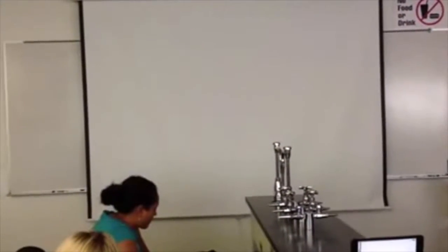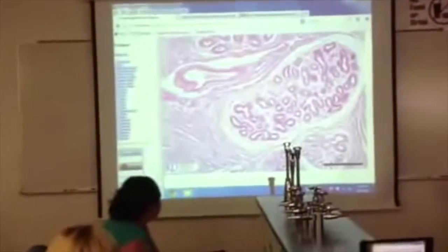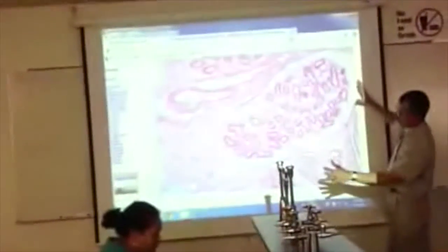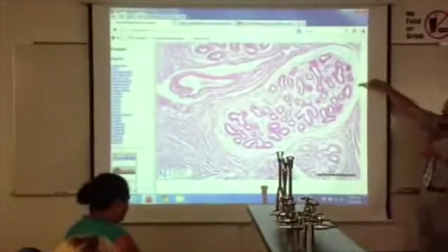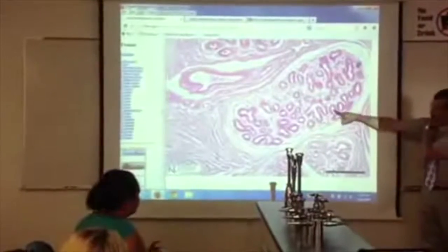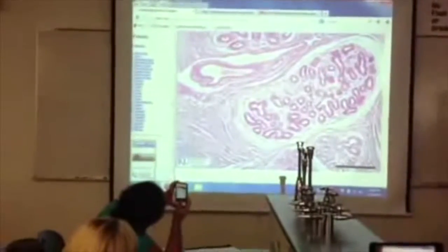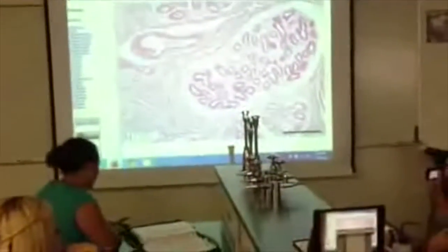And then compare it to this one here. What do you notice? A lot more glands. And fatter. They're bigger. There's more of them. They're shoved everywhere, and you're compressing the other tissue. So as you milk more, these get bigger. Hence, their larger size, right? You can see that they're producing more fluid. There's obviously more activity. So lactating, right? The problem is you can end up with ones that look kind of in between. Exactly. Like that one.